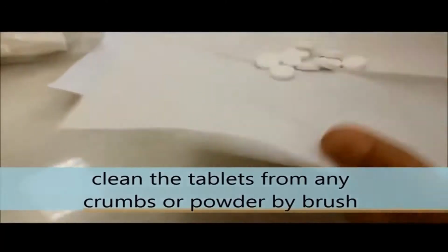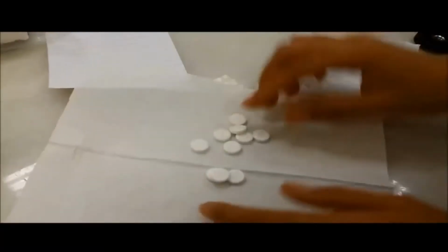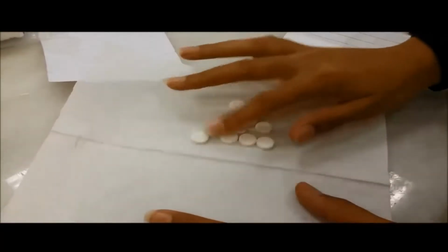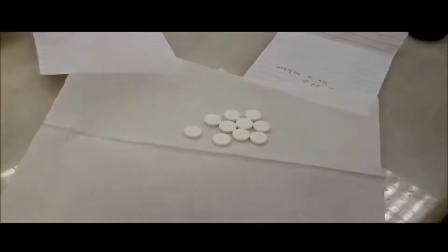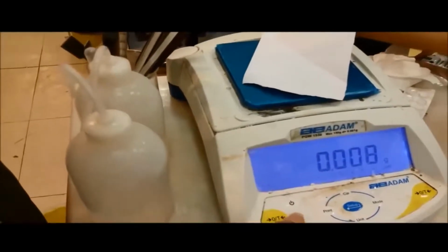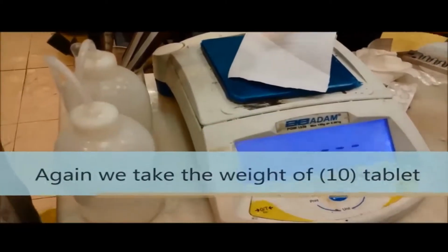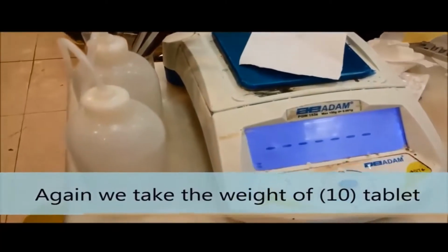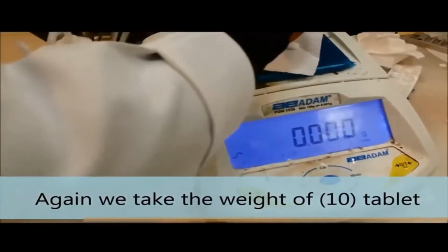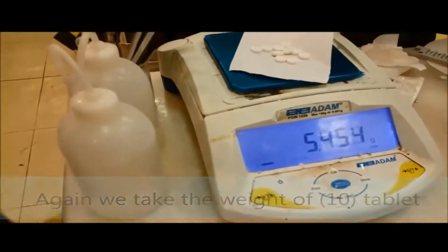Here, you can take your tablets. You should clean the tablets from any type of dust. Again, we have to take the weight of 10 tablets and record the weight.